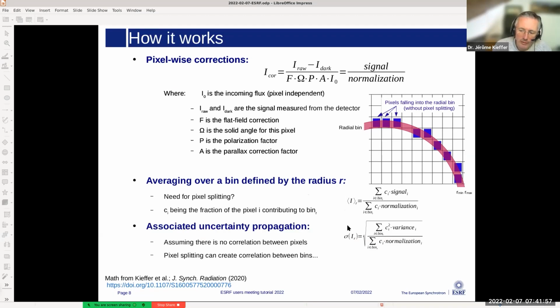So here is the average, here is the uncertainty related to the pixel intensity, and if we want to have the uncertainty on the value of the mean, we have to divide roughly by the square root of the number of pixels contributing. But in the formalism of the weighted average, it gives this formula, which is slightly more complicated.